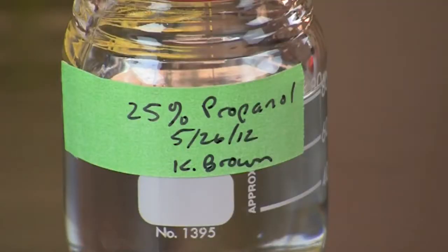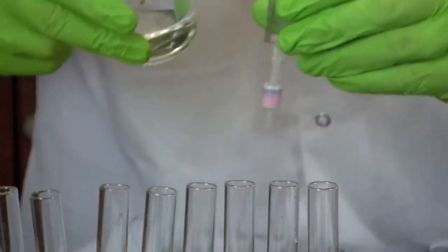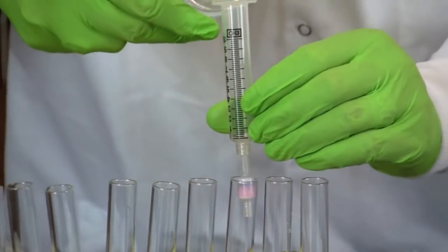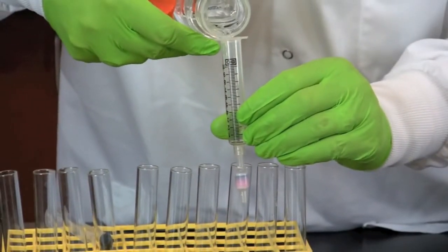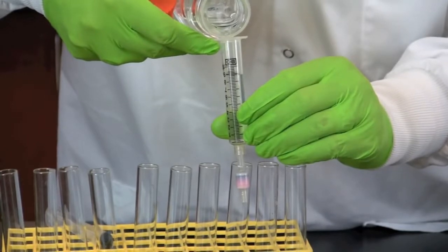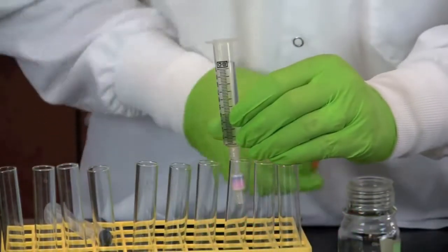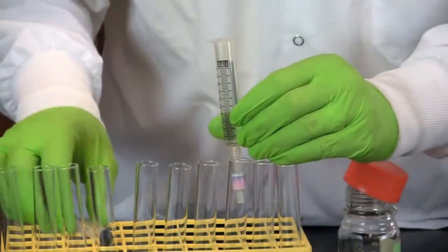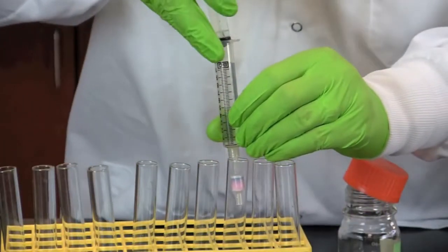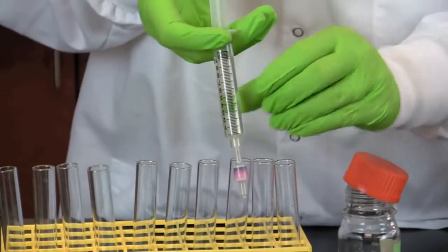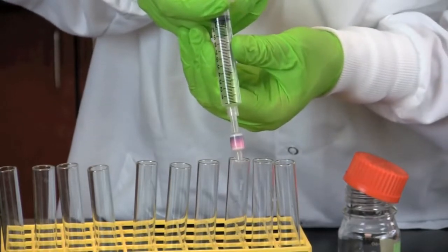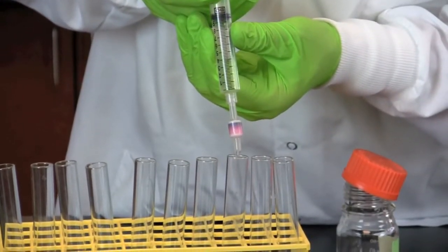You will now add 10 ml of 25% 2-propanol. Replace the plunger and push the alcohol through the column. Collect the flow through in the next empty test tube.